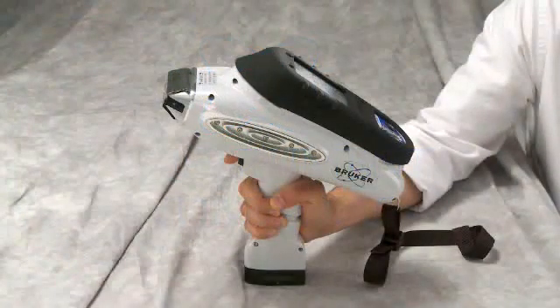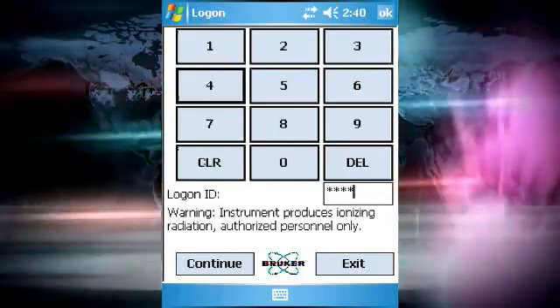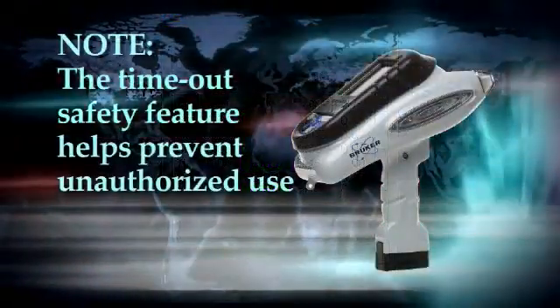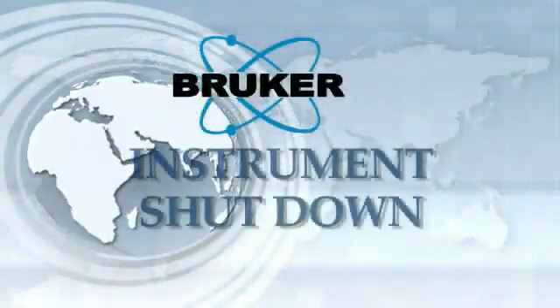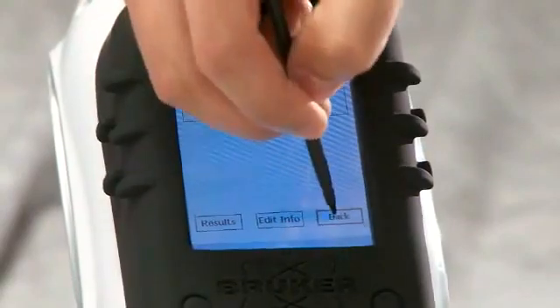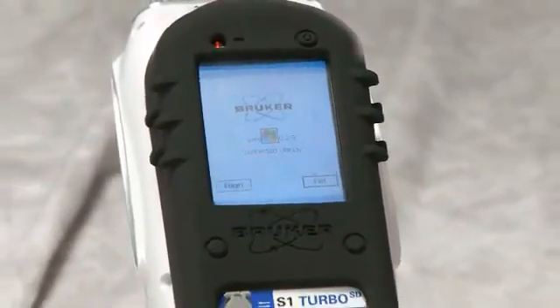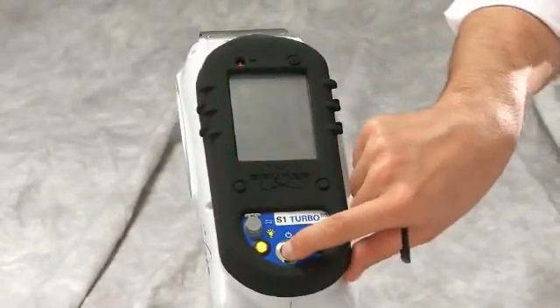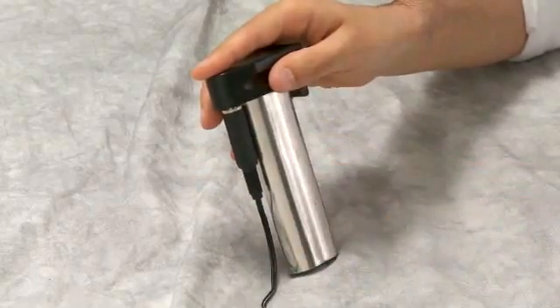If the instrument is unused for about 10 minutes, the password screen will appear. To restart the analyzer, simply input the instrument password and the analyzer will return to the exact state it was in when the timeout occurred. This timeout is part of the safety precautions so that an untrained person cannot operate the instrument. To shut down the instrument when you have completed your work, simply tap the right-hand button on the bottom of each screen until you reach the PDA home screen. Then press the PDA power button and the analyzer's power button to turn each off. It is recommended that while the S1 Turbo is not in use, the PDA and the analyzer battery should be attached to their chargers.